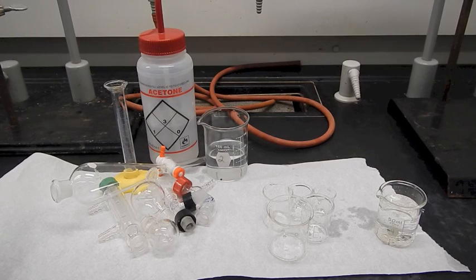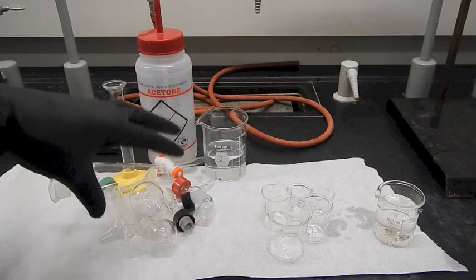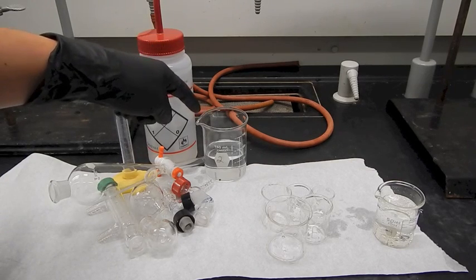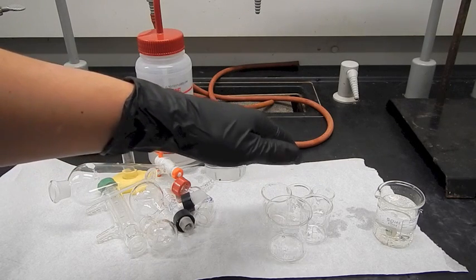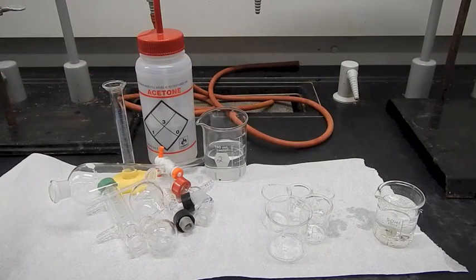Here's how we're going to deal with all of our waste. Here I've got all of my distillation apparatus and sep funnel pieces, I rinsed those with acetone, and I collected those all in this beaker right here. These were my washing beakers that I used for just water and stuff like that, so I just rinsed those with deionized water. And this beaker over here has my aqueous collections from my sep funnel washes.